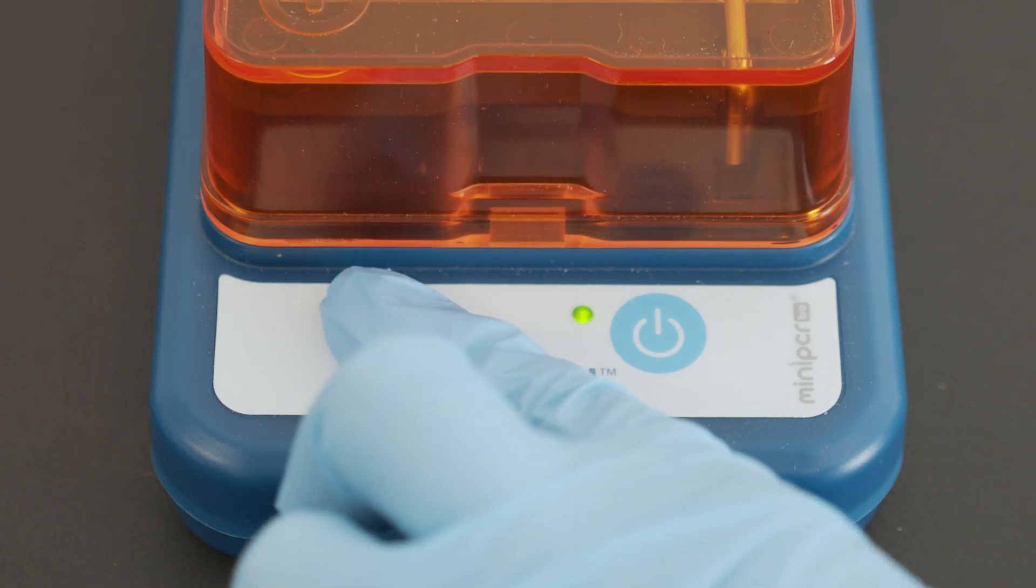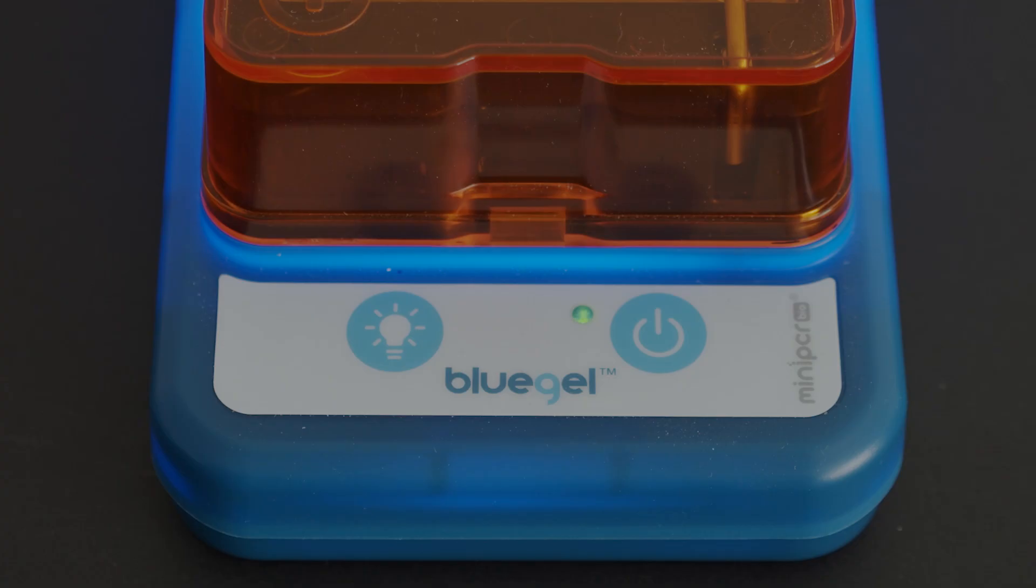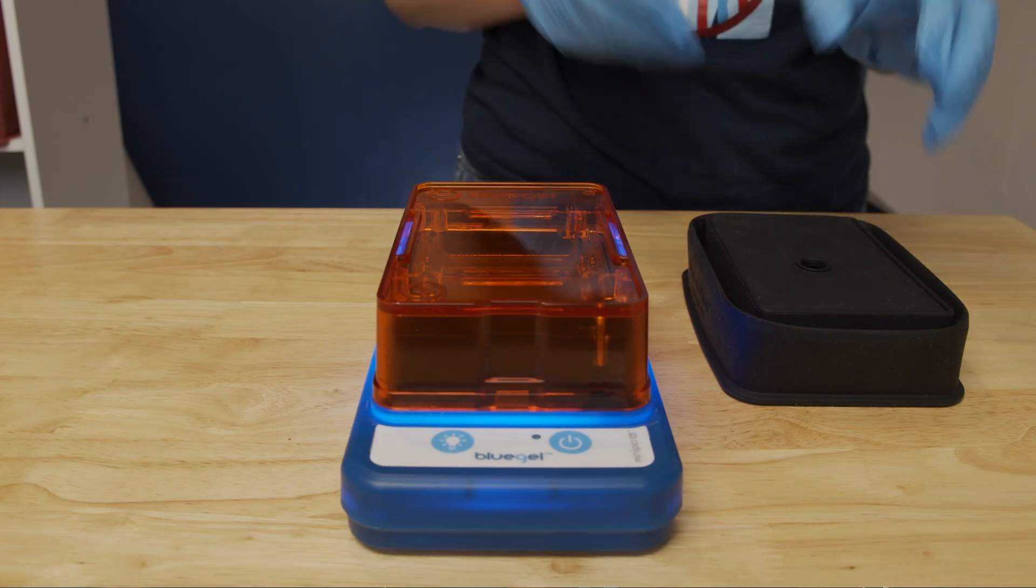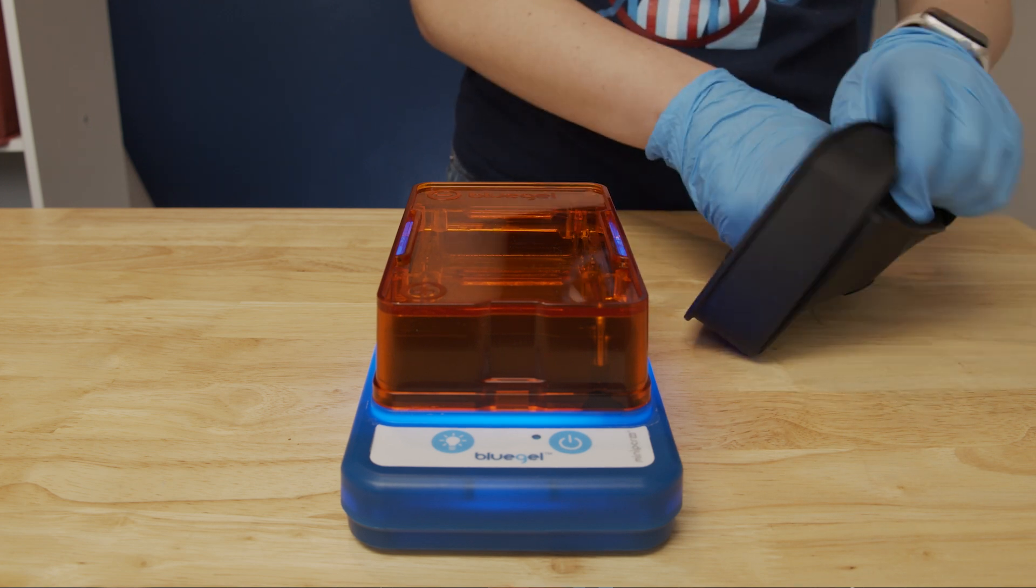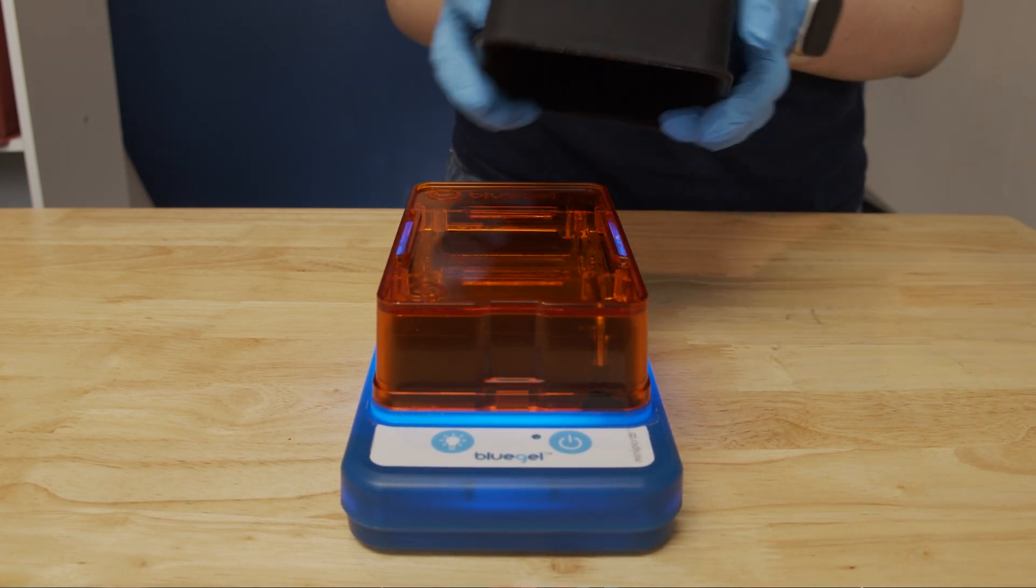Or place the black fold-over viewer over the orange cover and use a smartphone to take photos or a time-lapse. Simply pop the fold-over viewer open, place it over the orange cover, and set your phone camera lens over the hole in the fold-over viewer.